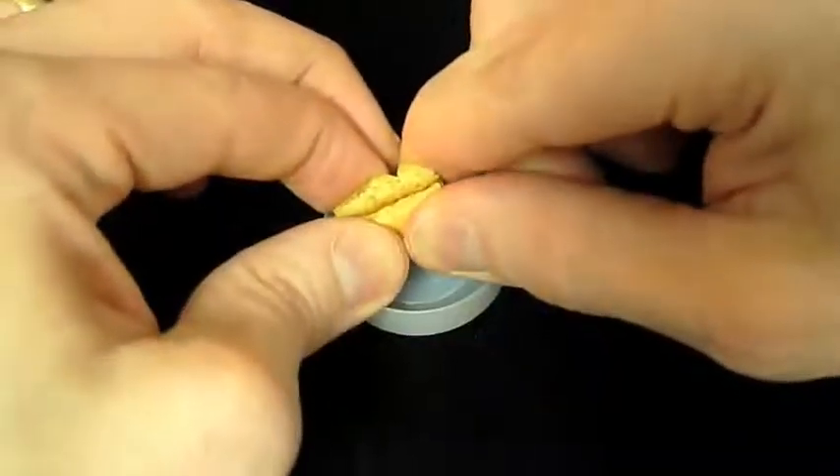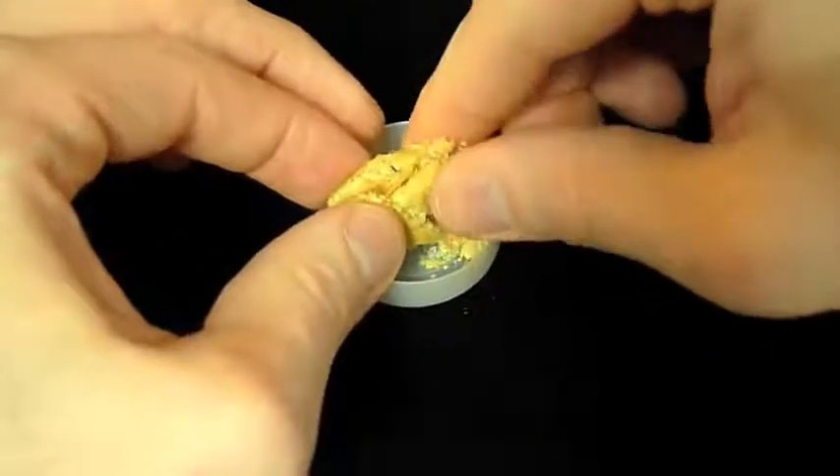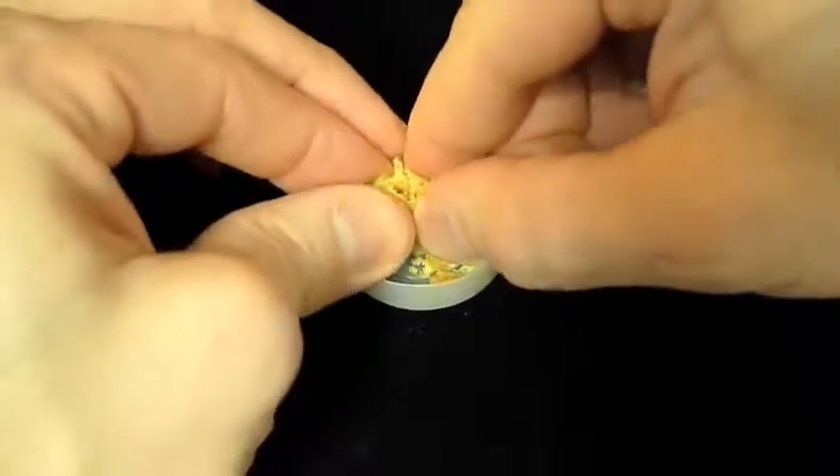As we saw earlier, cookies, crackers, and cake can be crumbled. Just cover the bottom of the sample cup with the crumbs.